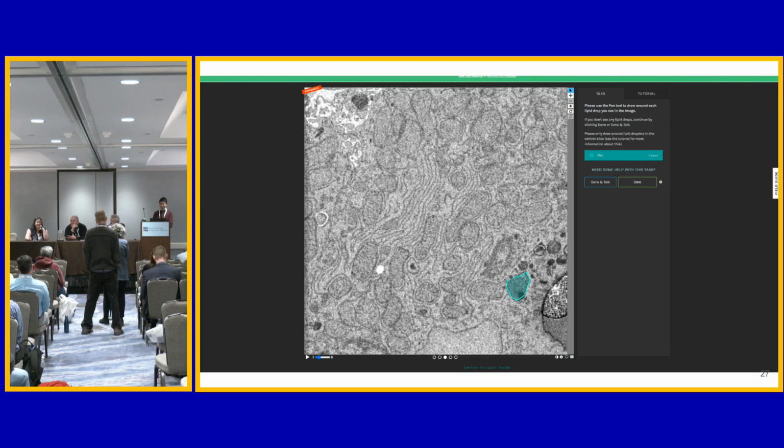I think once you get to that scale, you may wish to seek out your friendly local bioimage analyst. And if you don't have a friendly local bioimage analyst, I can be your friend. But we have definitely found that in terms of pathology stuff, the nice thing is, with small projects you can usually tune something, and middle-sized projects kind of can't do anything. But once the data gets big enough, you need more resources. You're probably going to need pretty decent GPUs. You're probably going to need a fair amount of tricks around how to do the normalization and things like that. But that sounds like a really fun project. Do you have that set up in your core institution?